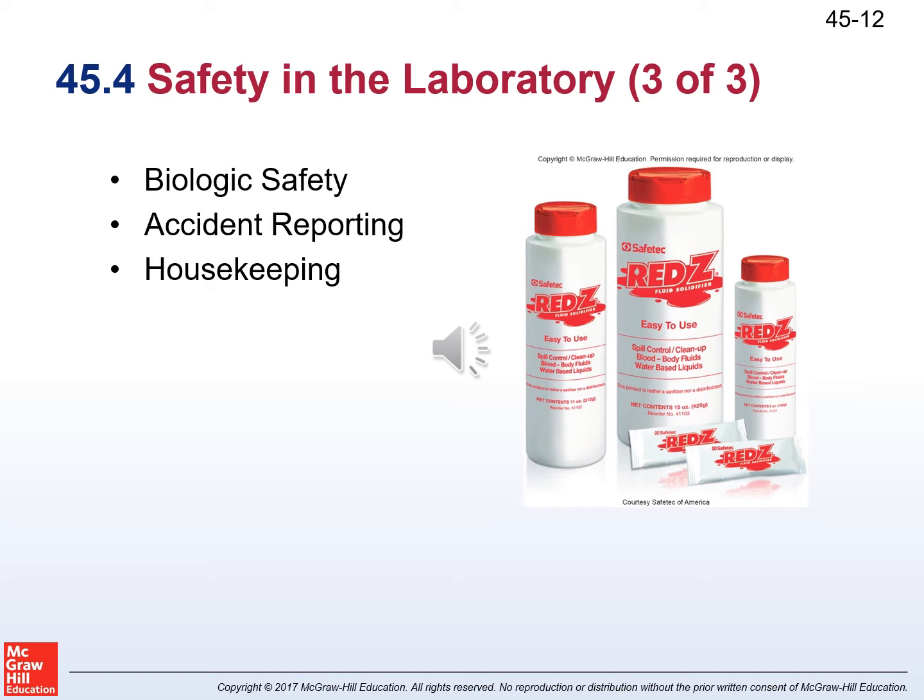Despite all precautions, laboratory accidents will still occur. Written procedures should be kept available to follow, but the medical assistant should be familiar with the procedures beforehand. OSHA regulations for incidents involving blood or blood products must be followed. The contaminated area will need immediate disinfection and sterilization. Incidents must be documented and alleviated for future prevention. Medical evaluation and follow-up of the employees involved may be needed.